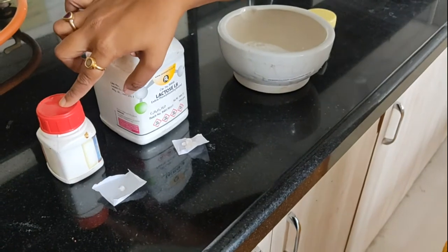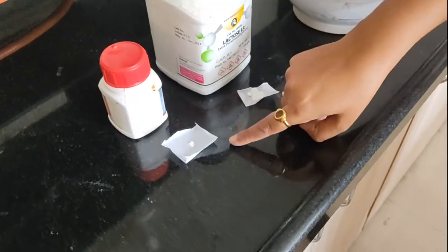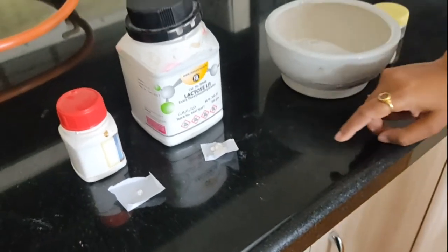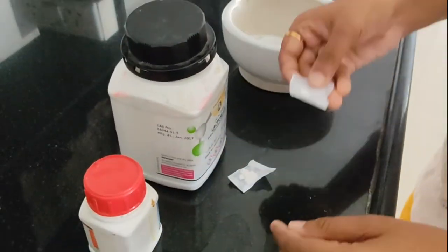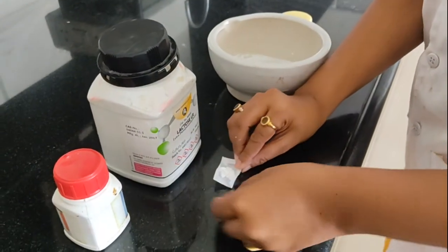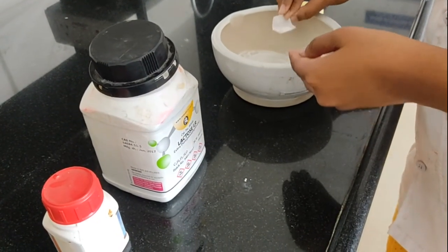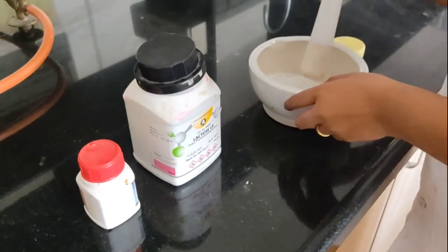We have codeine phosphate, which we previously read about. As we know, this is a potent drug, so it should be used in a small quantity. This is lactose, which is used as a diluent. So first of all, I am going to take this codeine phosphate into this mortar and pestle, and after that I am going to add a small quantity of this lactose into it, and then proceed for trituration in this mortar and pestle.